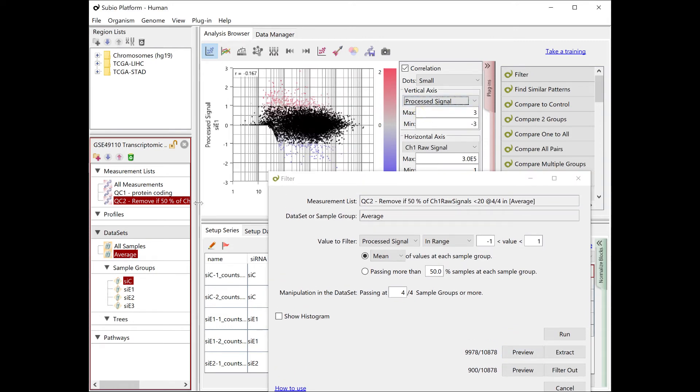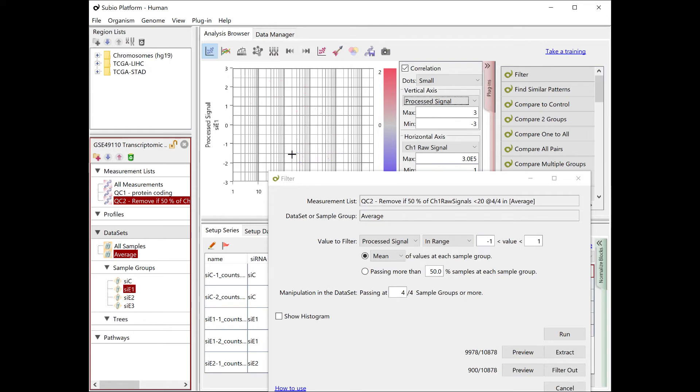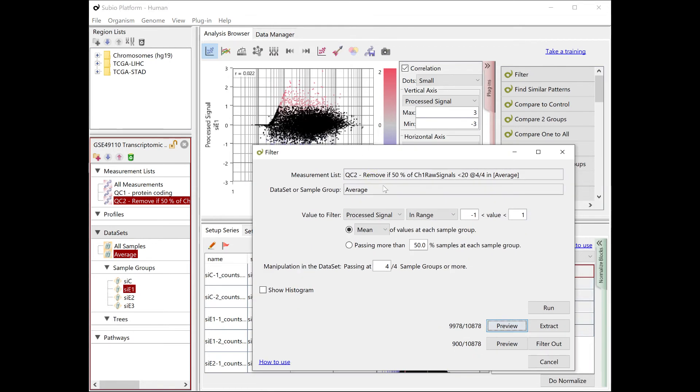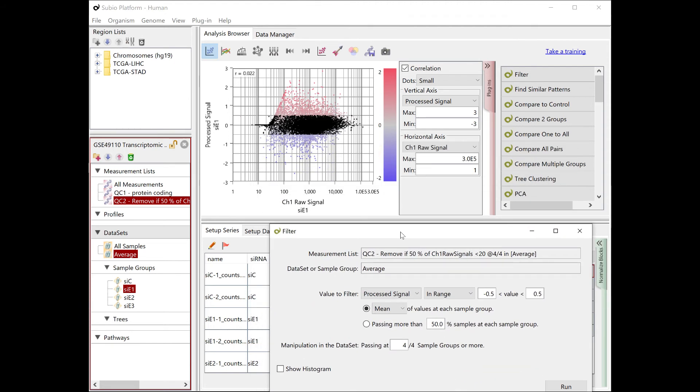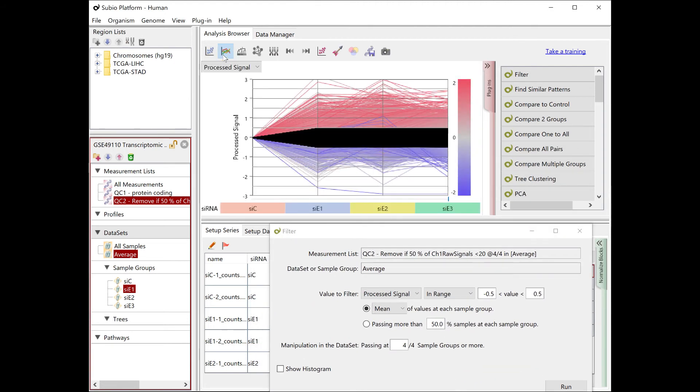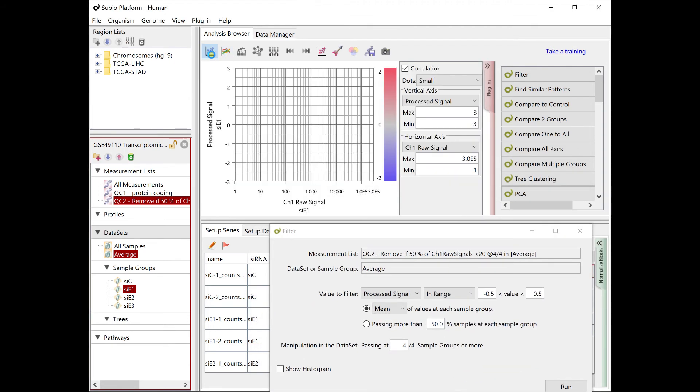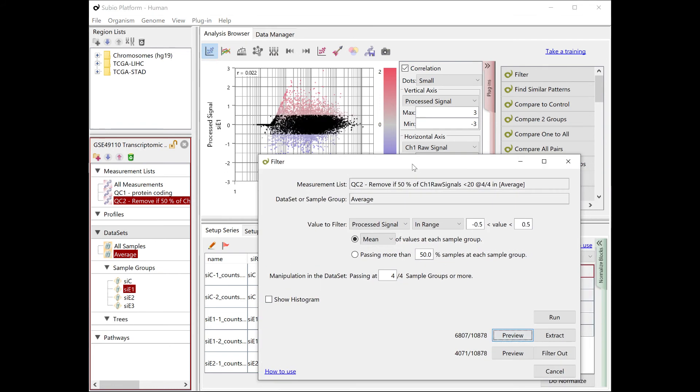This is too much, so adjust the width of the thresholds. Let's apply it from minus 0.5 to 0.5, which means 0.5 power of 2, equivalent to 1.41 fold. The new criterion looks appropriate to regard them as unvarying.